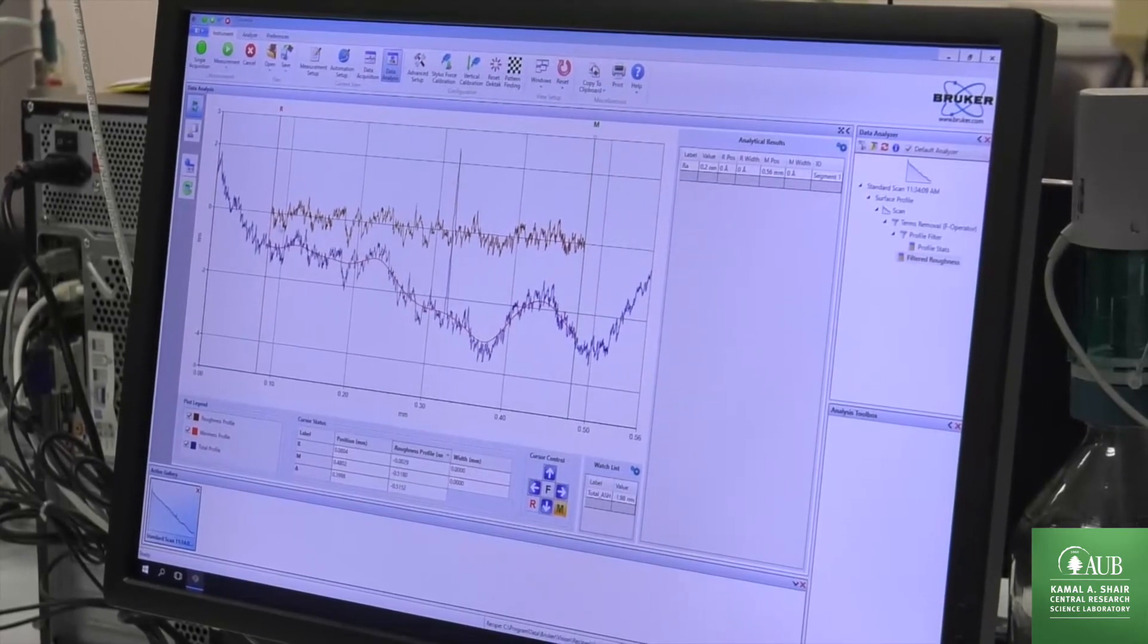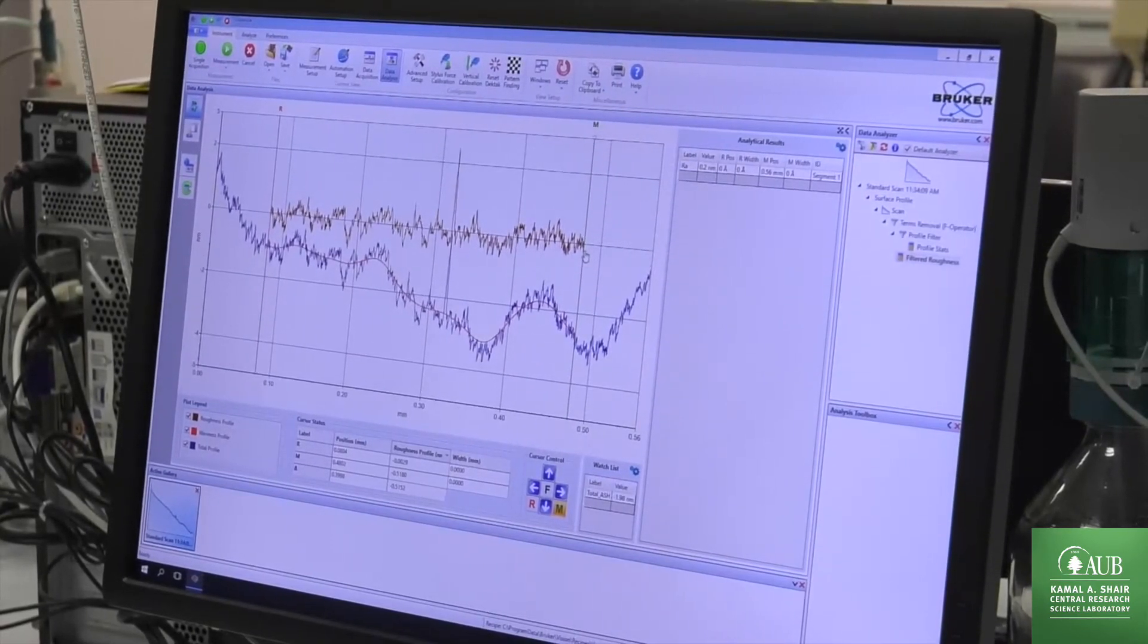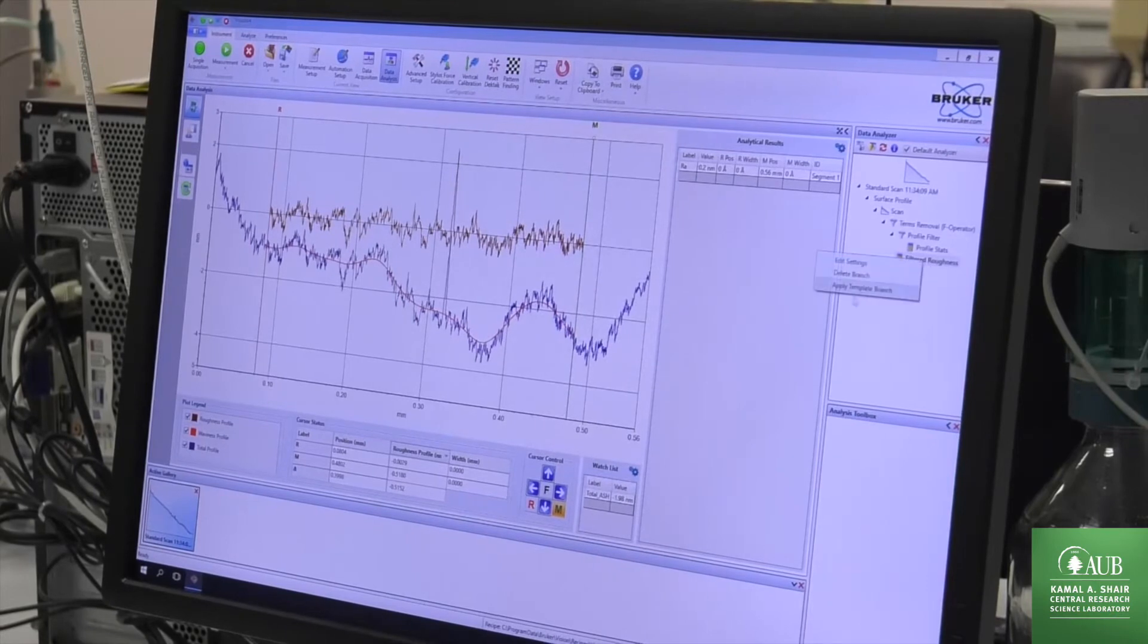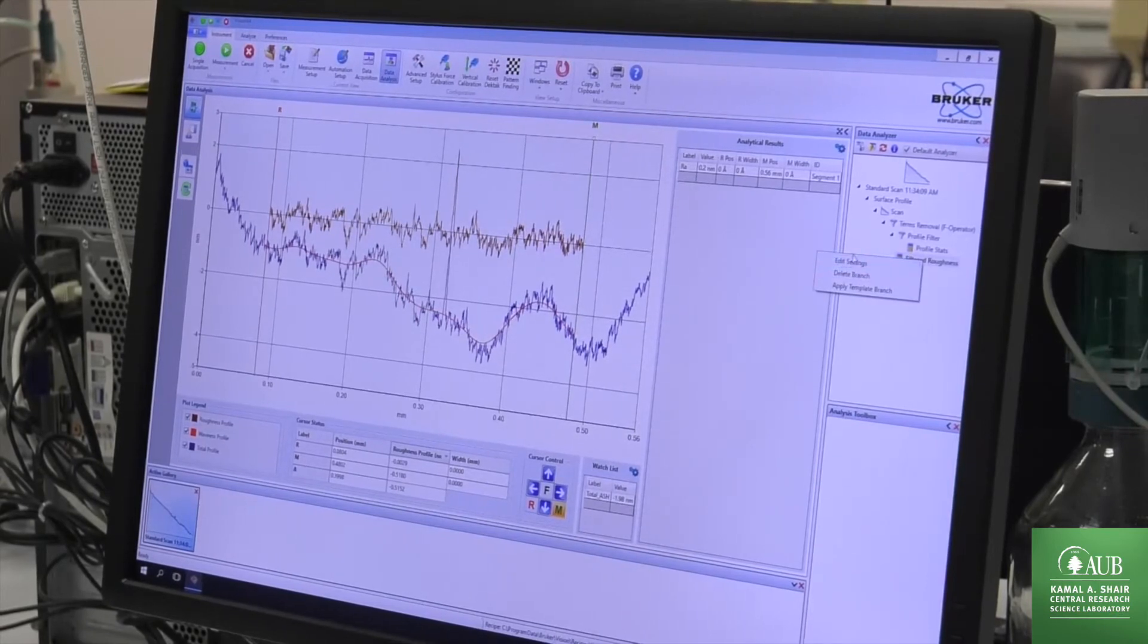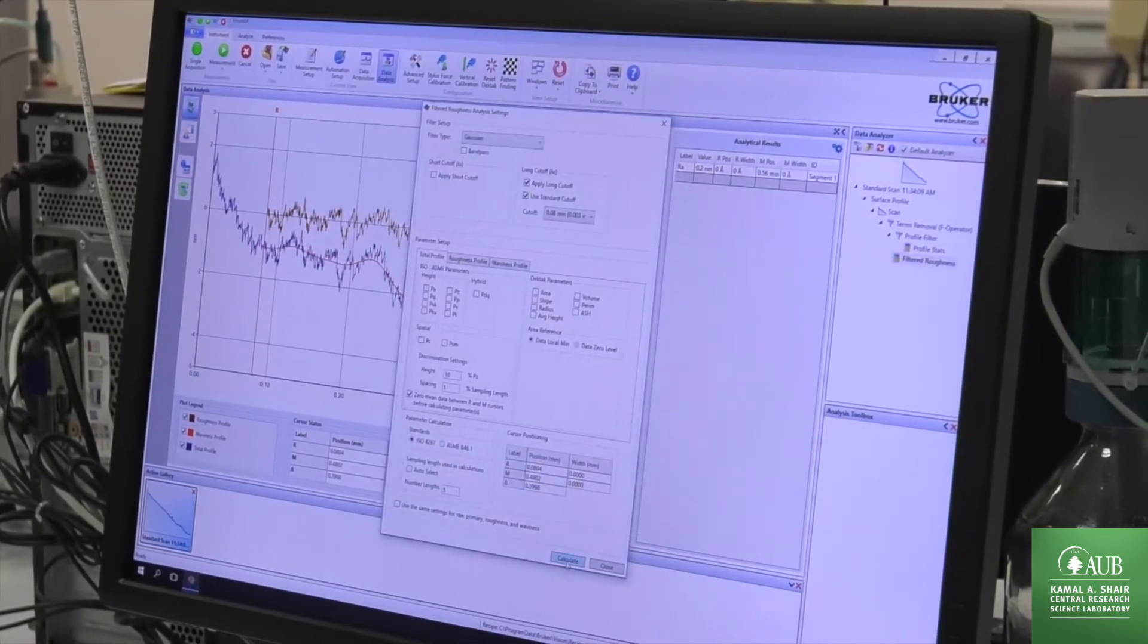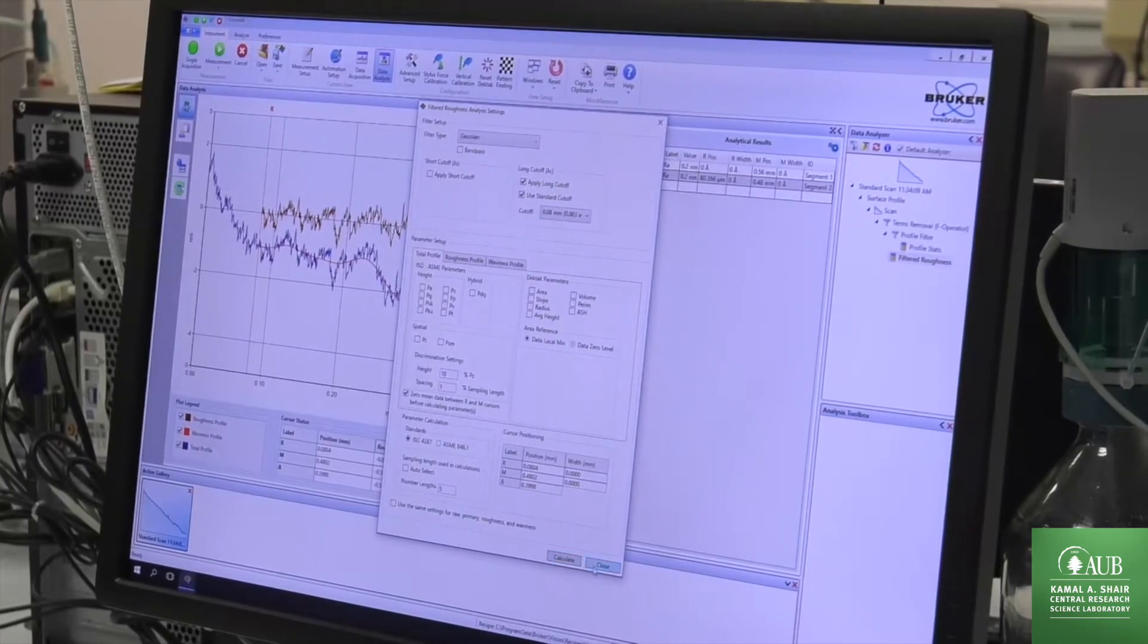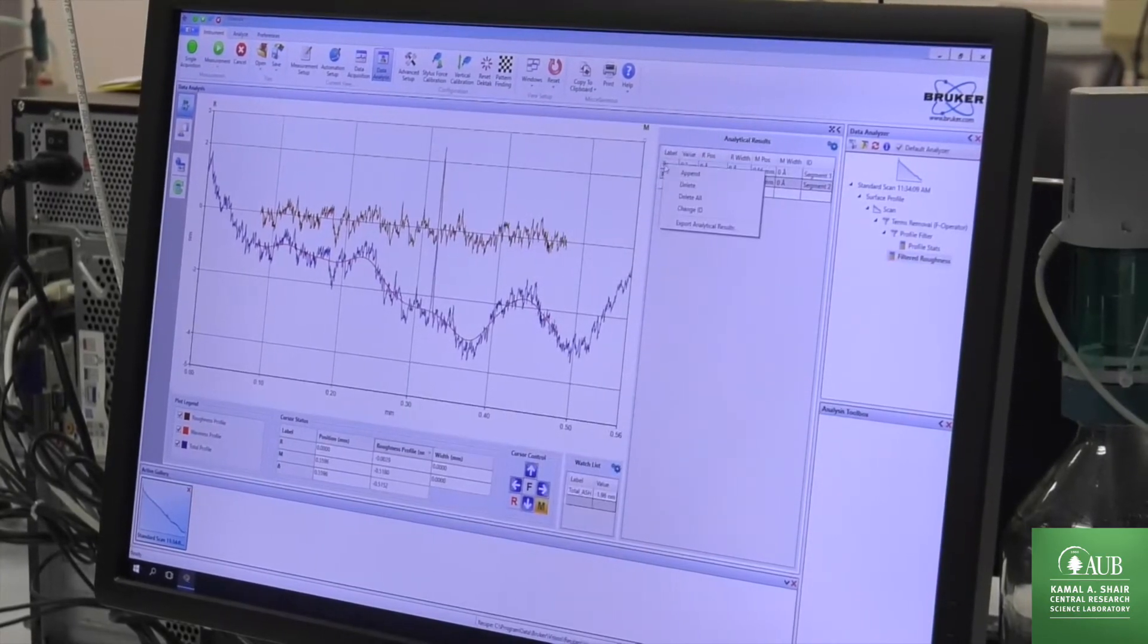That would be at 1 seventh, at 6 sevenths. And then I recalculate the roughness for these cursor positions. Simply click on calculate, close, and I can delete the old settings.